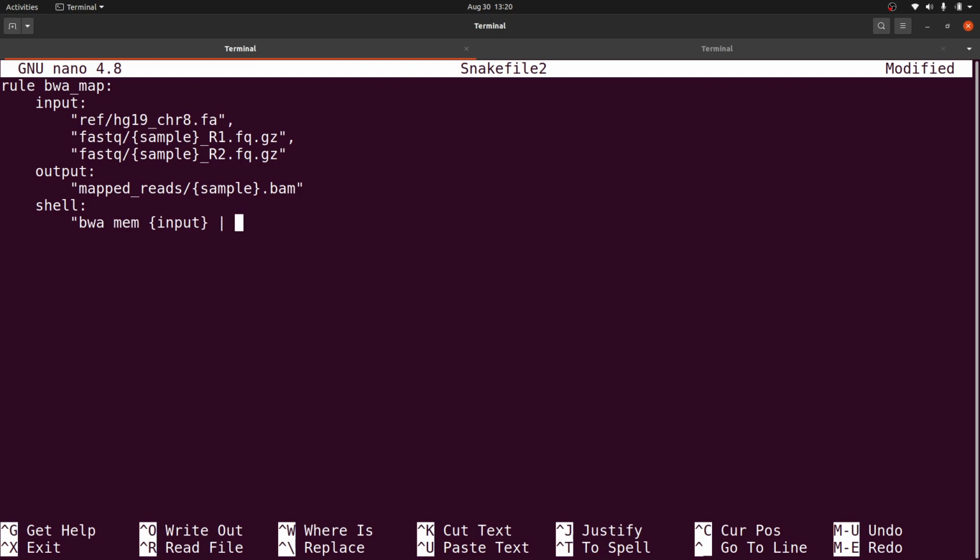So this time it's going to be some tools, then the output flag, and then you say outputs, and then you bring your dash, and you close it. So this becomes the command. This becomes a generic command that you can use.